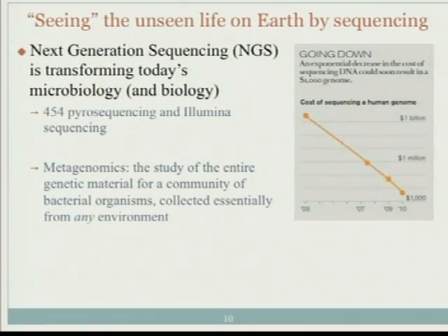So with this technology, because of the advance of next generation sequencing, it's possible that we are seeing the genetic material of a variety of microbial organisms.